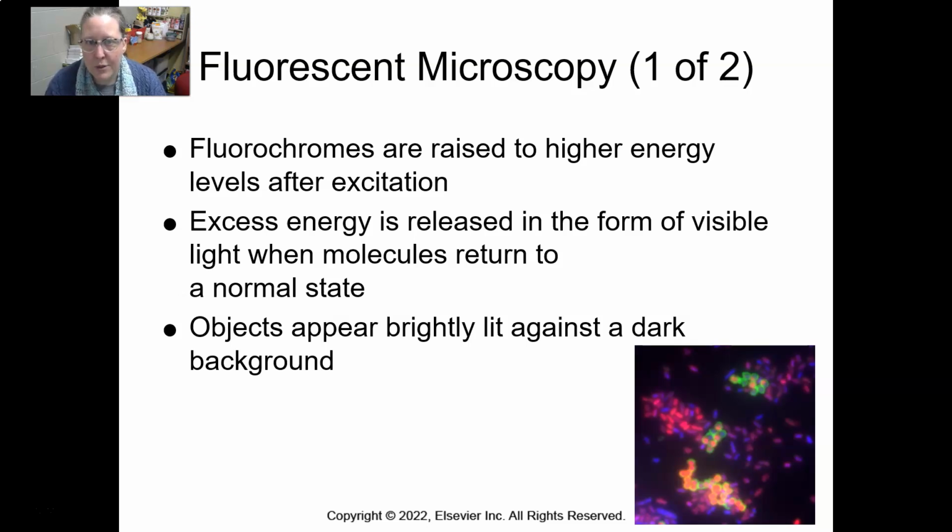The best way to explain fluorescence to me is if you've ever played with glow-in-the-dark little stars or any kind of glow-in-the-dark thing where you have to shine a flashlight or leave it in the sunlight to charge it, and then if you put it in your room, you turn all the lights off and make sure everything's dark, and you can see it glowing and emitting light. But eventually, of course, it emits all the light, and then it becomes back to normal. And you have to recharge it again. And so we can do that with microscopy. We can hit the specimen with light and then detect the light that's emitted from the fluorochromes.